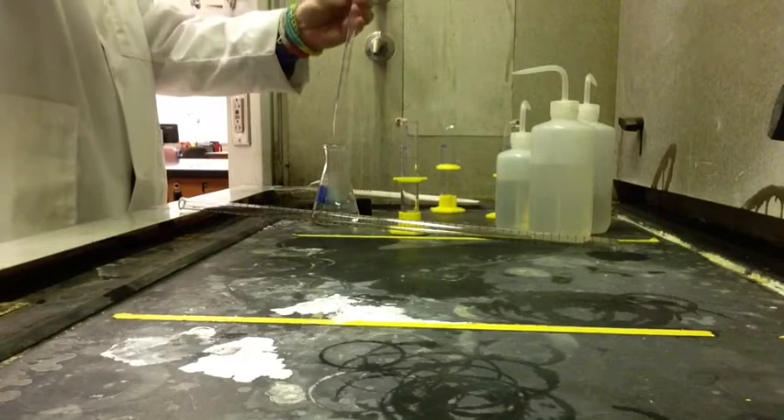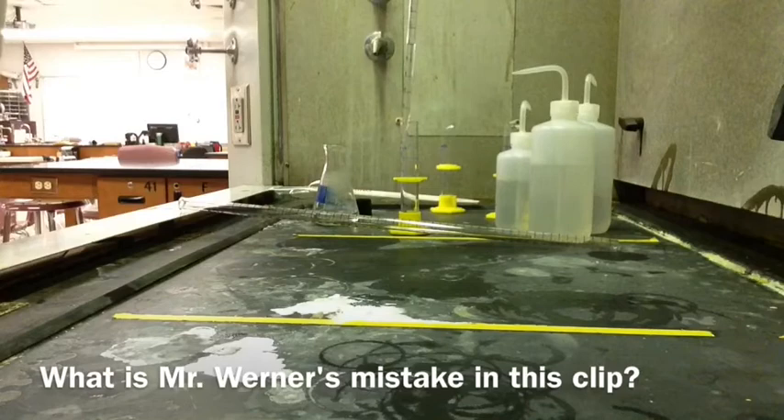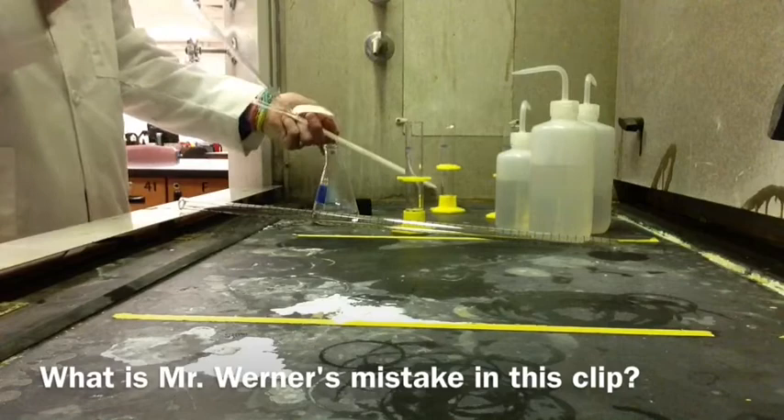Now you need to go to the hood and get your hydrochloric acid. It's 6 molar, so you have to dilute it to 2 molar and get 20 milliliters of that. Use the pipette and the pipette pump, and make sure that you measure it out carefully. You can put it with water in the cylinder.